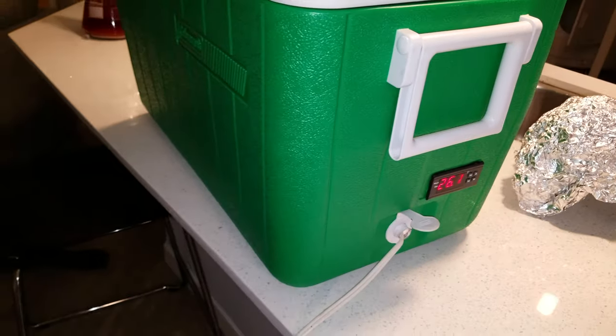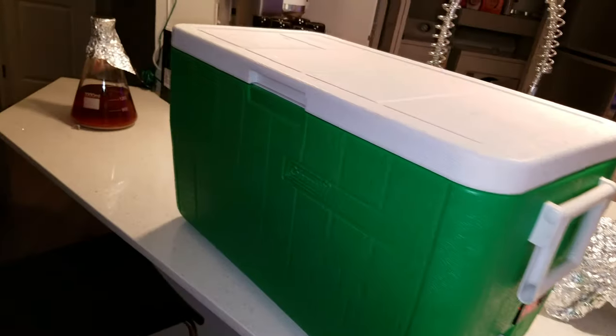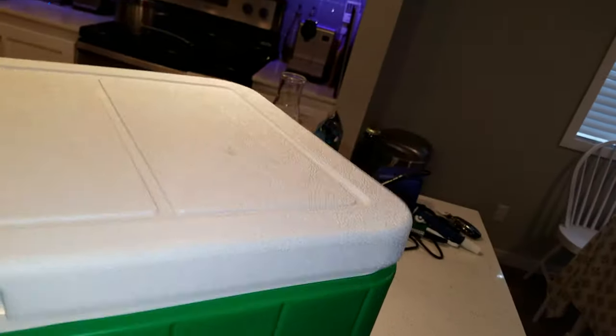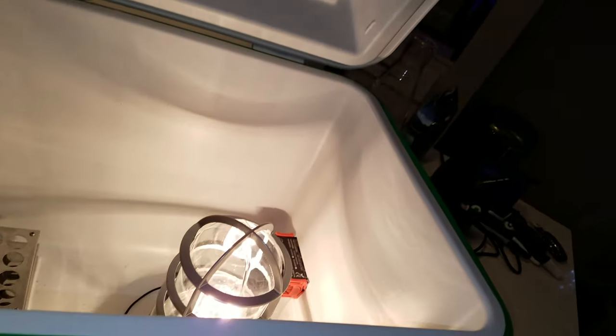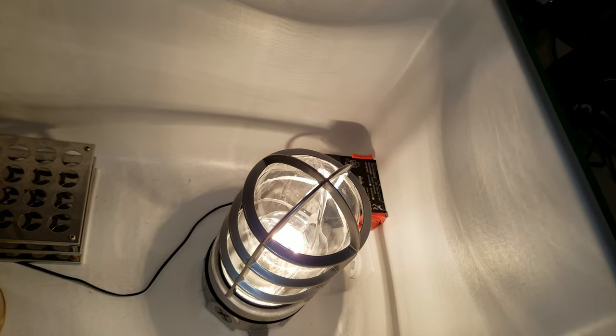I just got an extension cord that you can see here — it just runs to the wall. I cut the end off of that one and wired it up. You can look at the inside here: it is controlling, turning on and off a lamp on the inside.